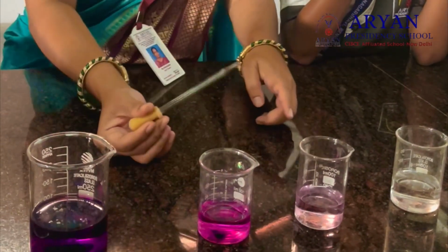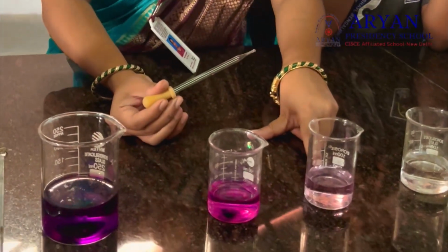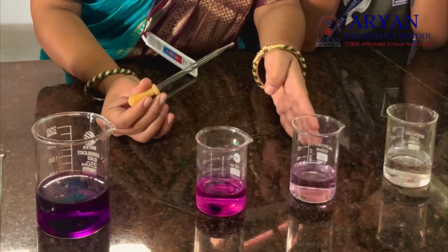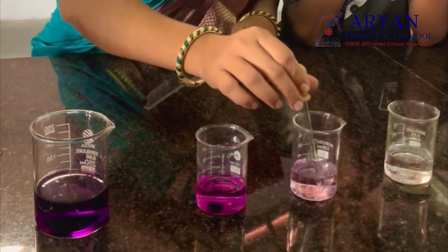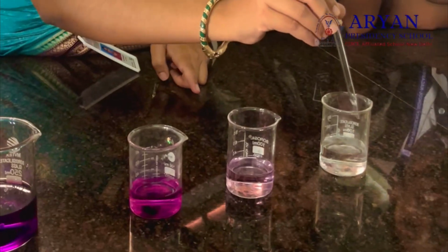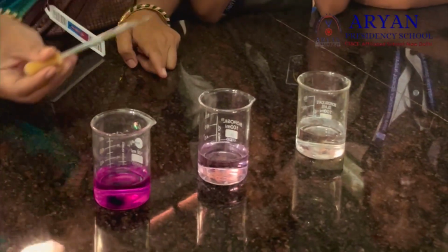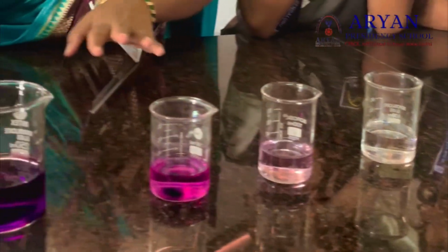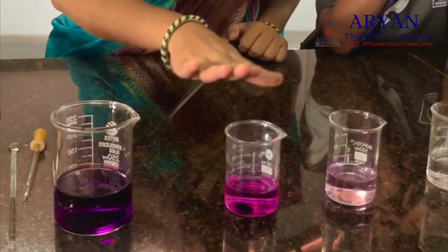Now what is the color in beaker C? Yes, you are getting a light color, which means the color is getting reduced. Understood? Now I'll take 10 ml from beaker C and transfer it to beaker D. Now what is the color? It's almost not there. Now you are repeating the same process from beaker A to B, B to C.